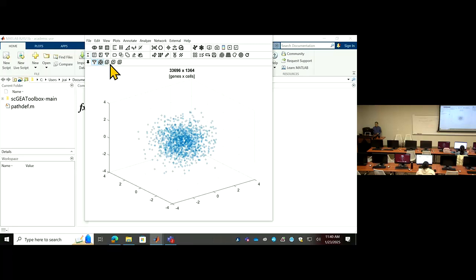After that, the third button you should click is this one, the 3 bubbles. This will help you cluster those cells into isolated groups by labeling them. Then number 4 should be this button here, to allow you to annotate the cells of each group.